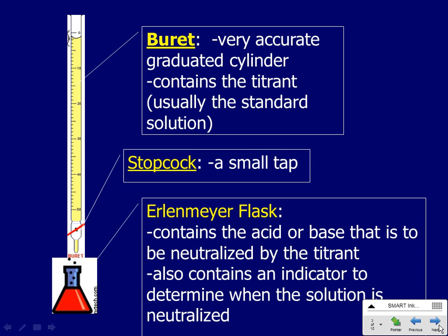When you store a burette, because we will be using it for a couple of days, you always store it inverted with the stopcock open so that any liquid that's in the tip can drain out. And we'll look at that a little closer. Again, you can see there's many graduations in this particular device, and it goes from 0 up to 50. Actually, I'll invert it and get it into the proper orientation. So we can put 50 mils in here.